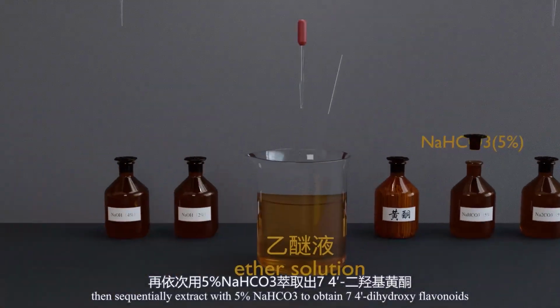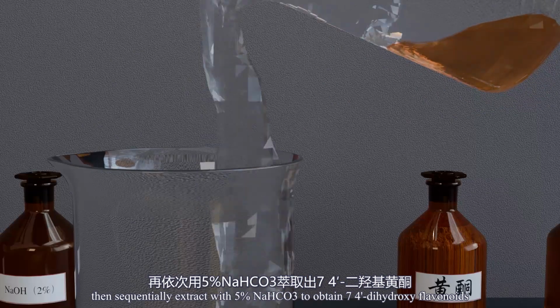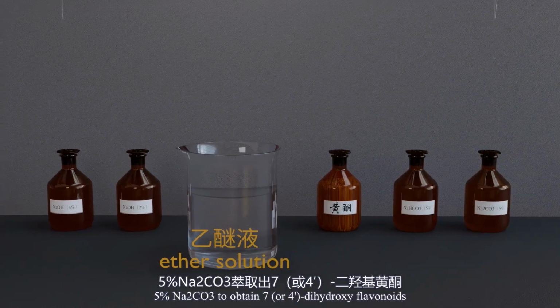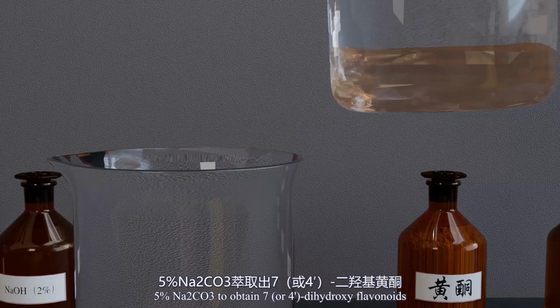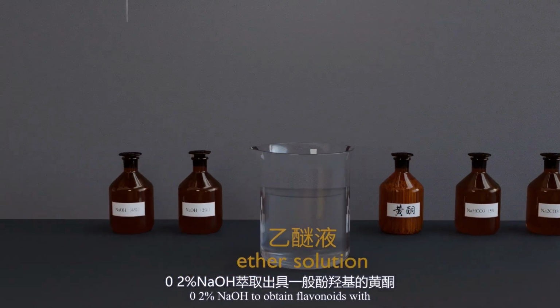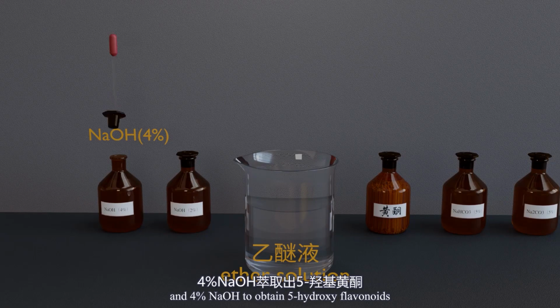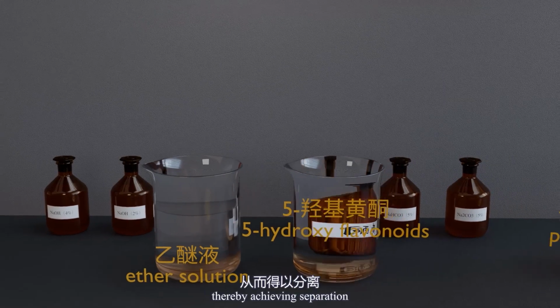Then sequentially extract with 5% sodium bicarbonate to obtain 7,4'-dihydroxyl flavonoids, 5% sodium carbonate to obtain 7 or 4'-hydroxyl flavonoids, 0.2% sodium hydroxide to obtain flavonoids with general phenolic hydroxyl groups, and 4% NaOH to obtain 5-hydroxyflavonoids. Thereby achieving separation.